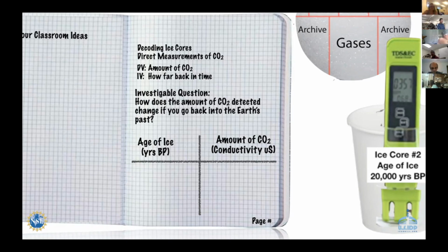If you were doing this in your lab and you had a 2-liter bottle, you could use a lot more water. Then just figure out what the conductivity is and write that number down. Mine says 5 for number 2. When you're done, get your deionized rinse water and rinse that conductivity meter off. Then you're ready for the next one.